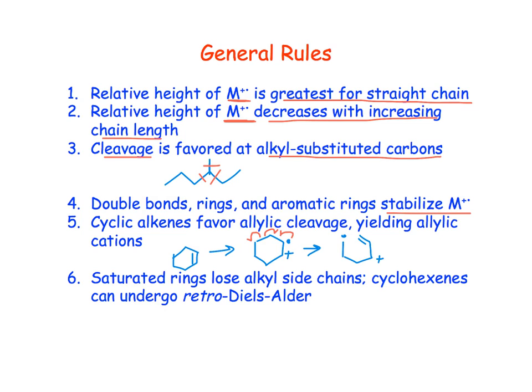And then, just like with the McLafferty and those kind of things, it can do another radical initiated cleavage.